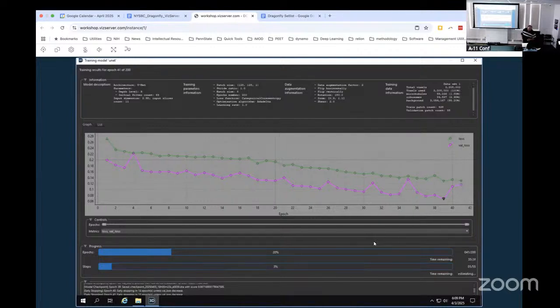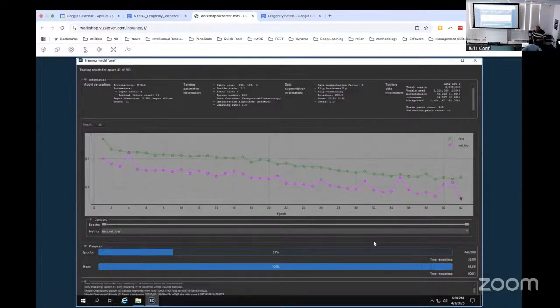Oh, I don't know what you're saying. You can change that too, you can set it, but by default, if you set the triangle, it's still keeping that, so it's the last best. But I found that between like 50 and 200 epochs is pretty good for most things.